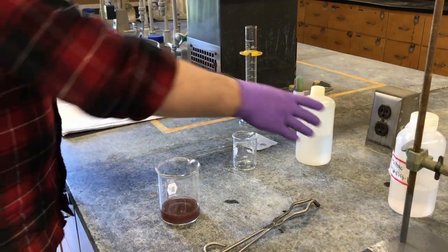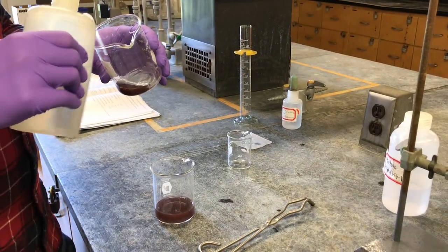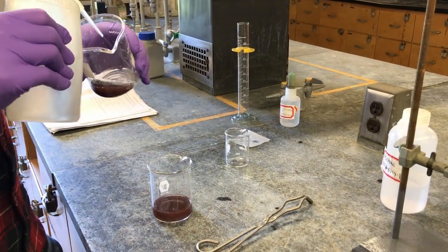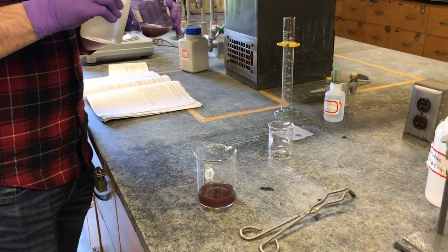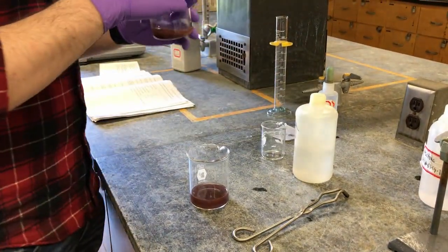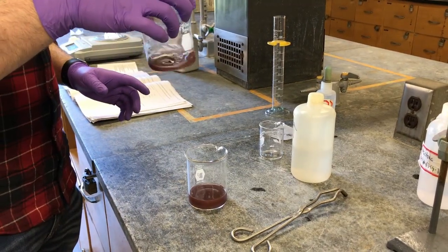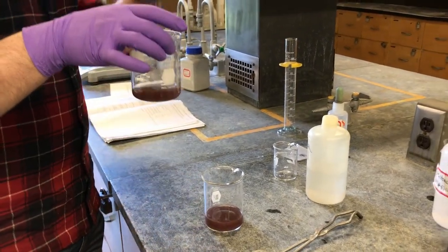One more time. So we're going to want distilled water in here, maybe about 10 milliliters, or more, but not too much. And this is what we're going to be pouring into our Buchner funnel.